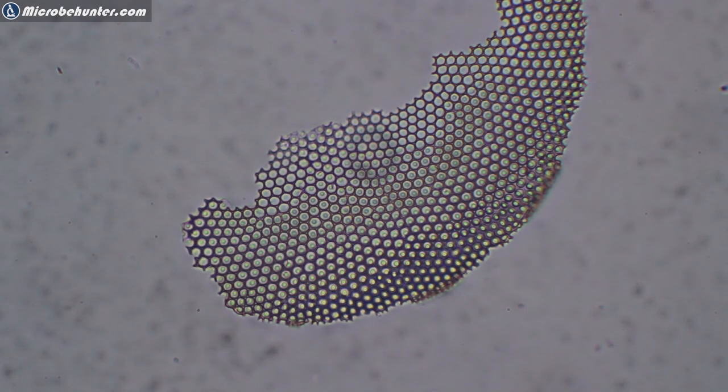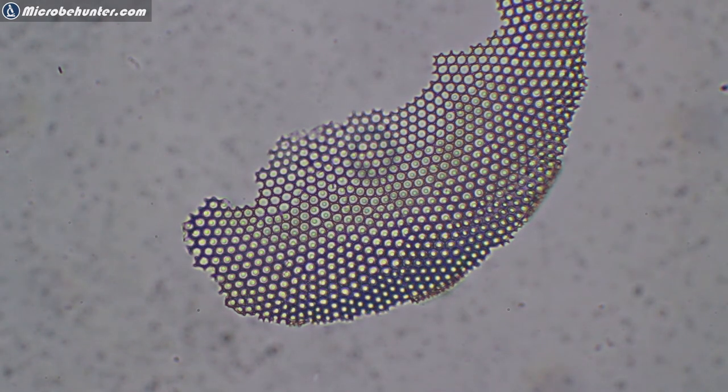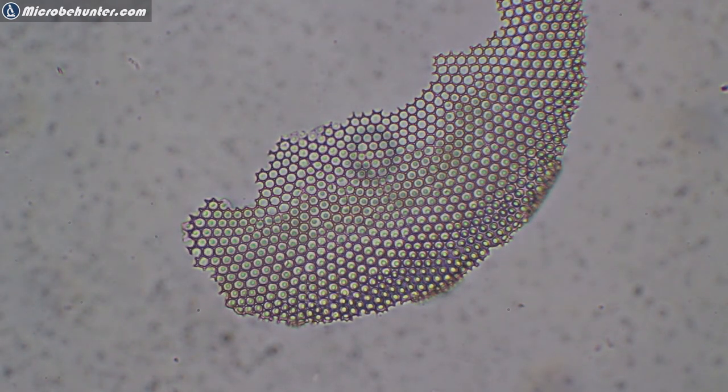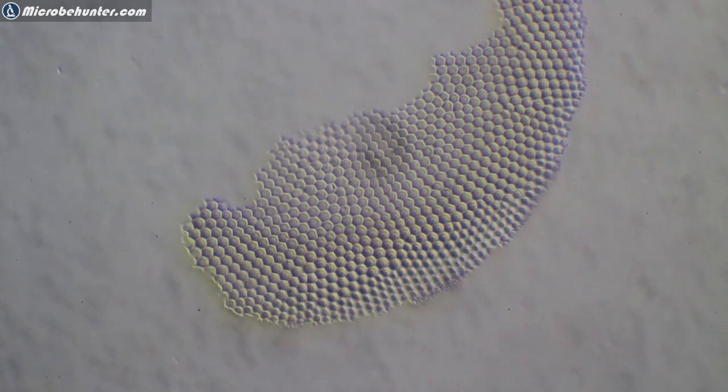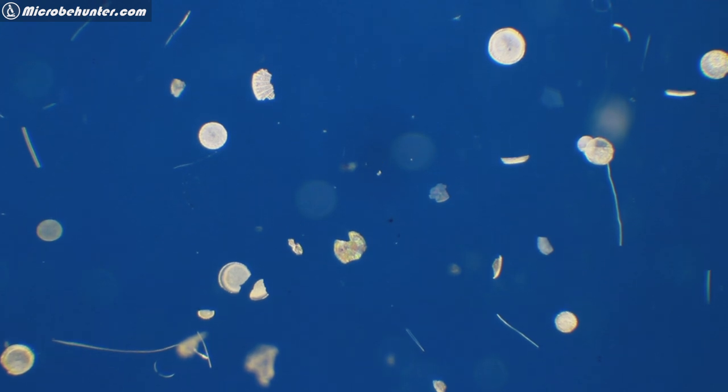And here, these are some diatoms, some marine diatoms, where I'm simply showing you now the different types of contrasting techniques. The dust and dirt that you see, that's unfortunately part of my camera adapter. This is oblique illumination, so that gives you this slightly three-dimensional look. And this is dark field with the filter rotated all the way in. Yeah, see, it's actually quite easy. You get three different imaging techniques simply by rotating the filter in and out.